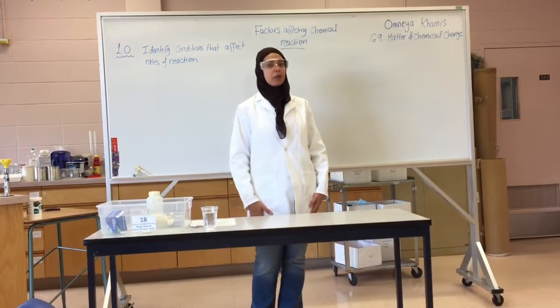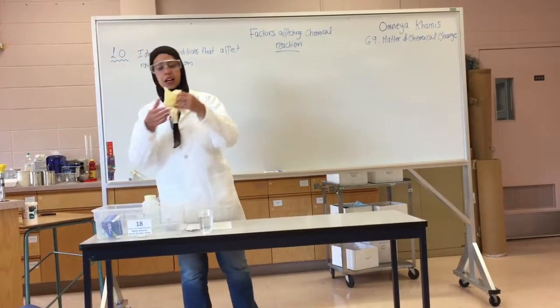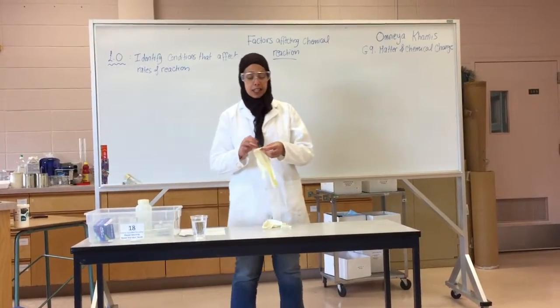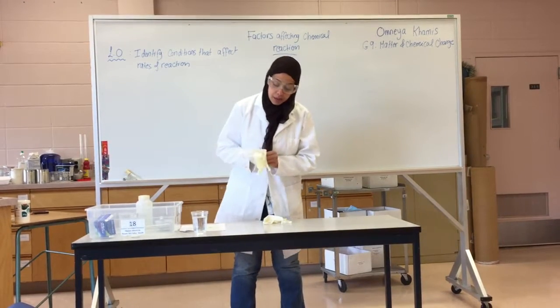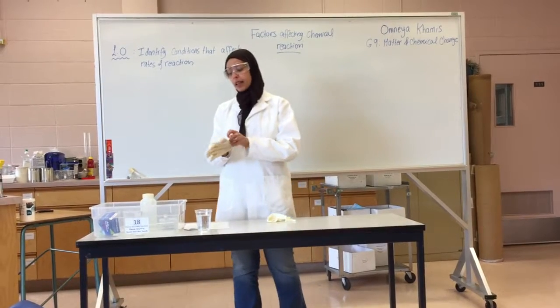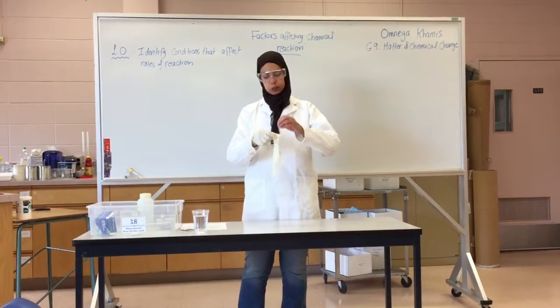It's essential to wear a lab coat while you're doing your experiment. And for this one, I'm bringing gloves. So I have to wear gloves in case of any chemicals that might spill on my hands, right? So make sure before starting any lab that you are taking safety precautions.